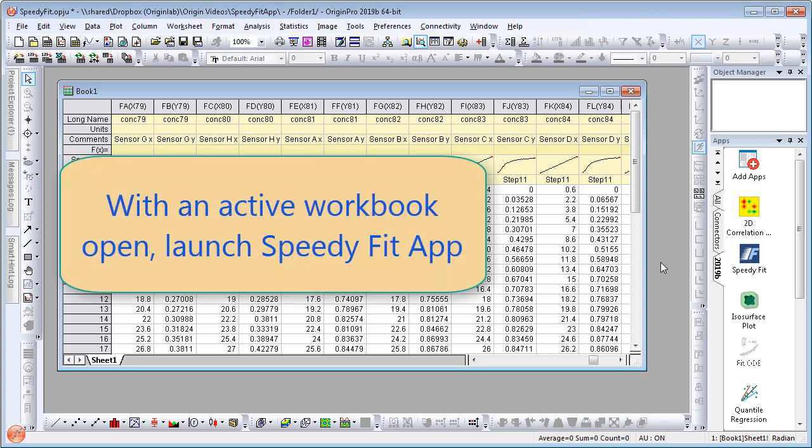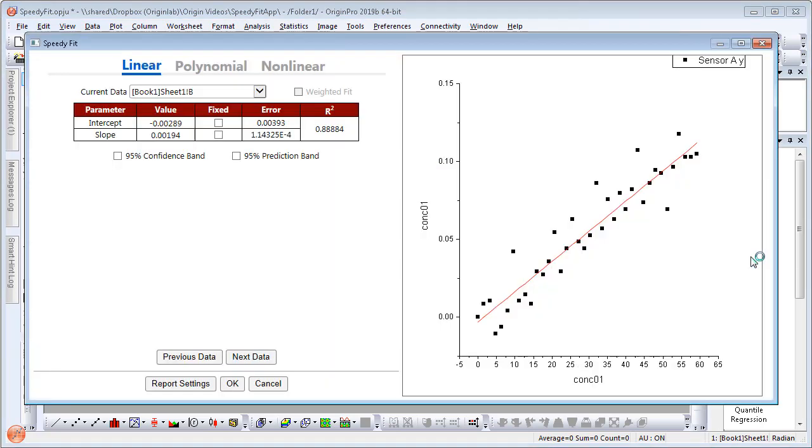First, with an active workbook open, you can simply launch the app from the right side app menu. The app then picks up the very first data set from the worksheet.